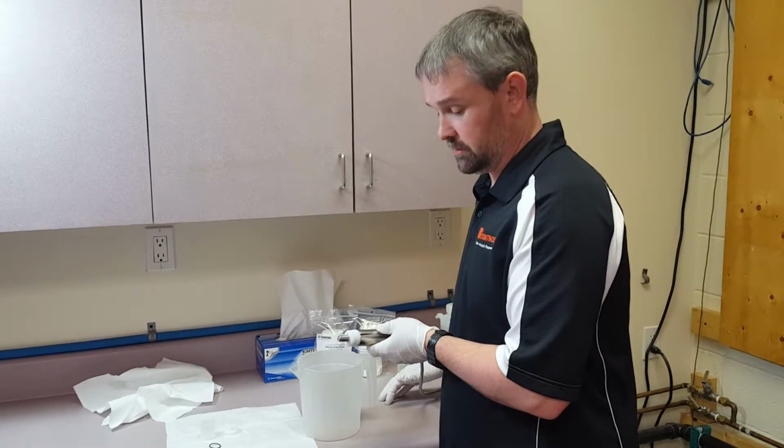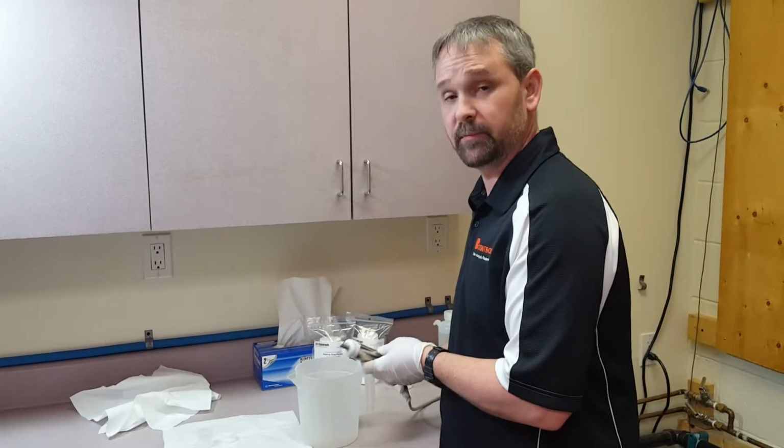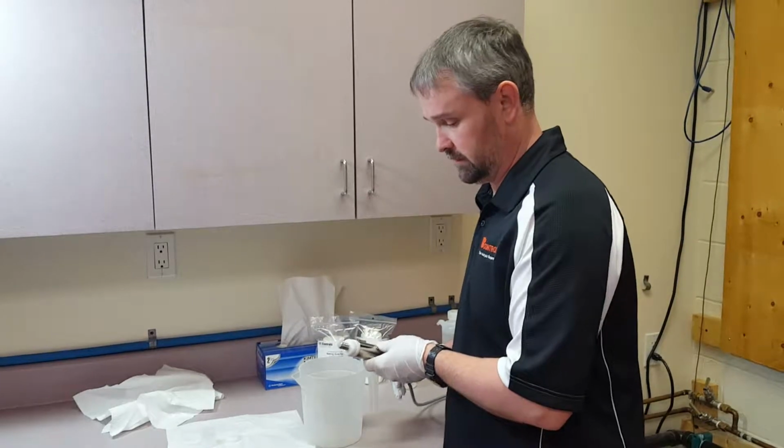This is an IC Controls instructional video on how to charge your PPB dissolved oxygen sensor.